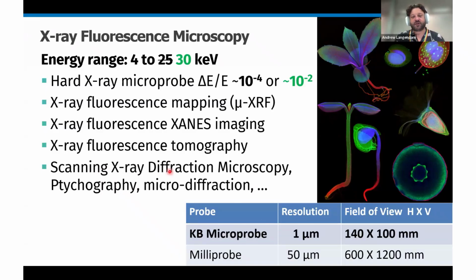This X-ray scanning diffraction microscopy. We do ptychography, microdiffraction, all this sort of stuff. And we have two main end stations as well. We have a microprobe and a milliprobe.